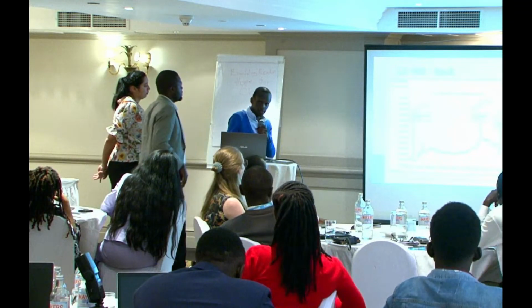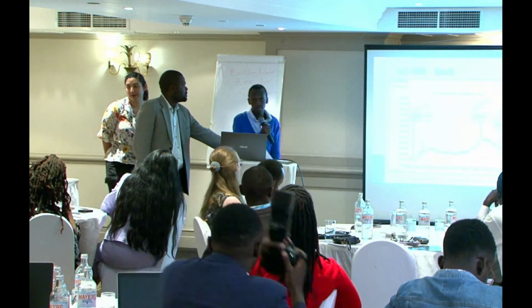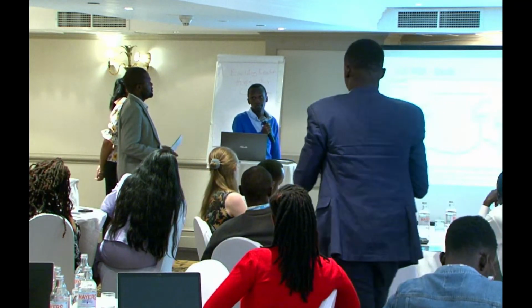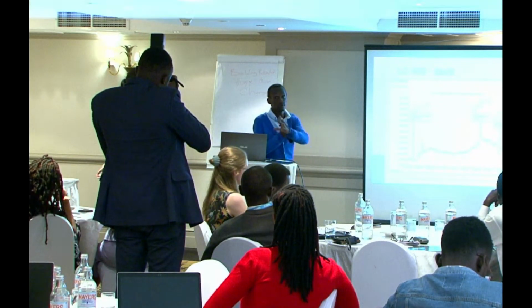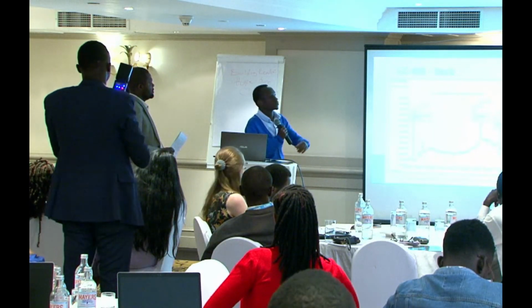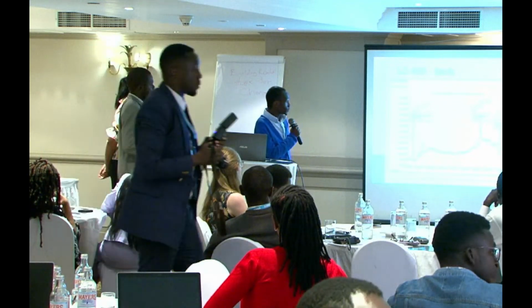With respect to the LCMS data, this is quite interesting. Work has been done previously on the bark, and it's important to note that the bark was collected from Mombasa, Diani, but our collection was from Mau Forest, quite different: 0 degrees, at least around 100 meters above sea level. Ours is 1,200.